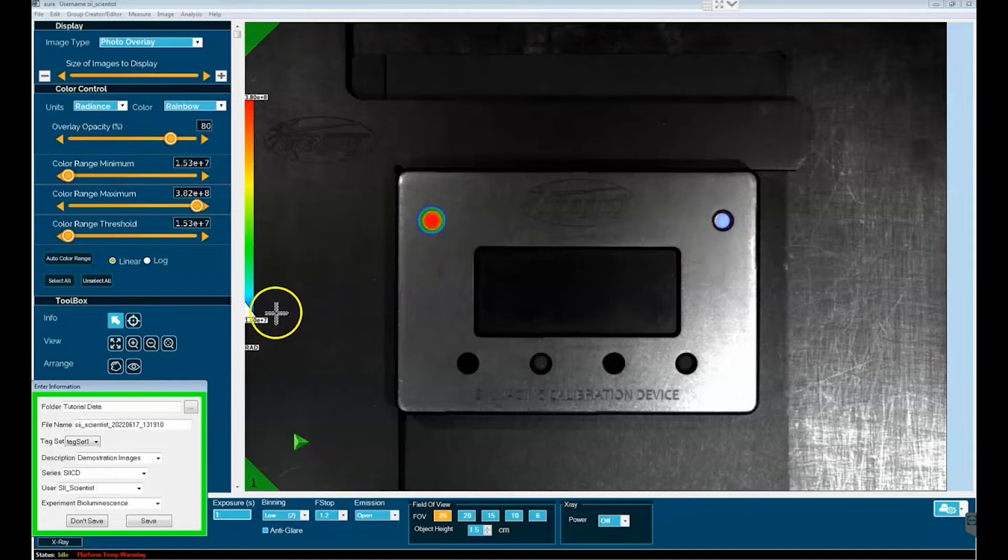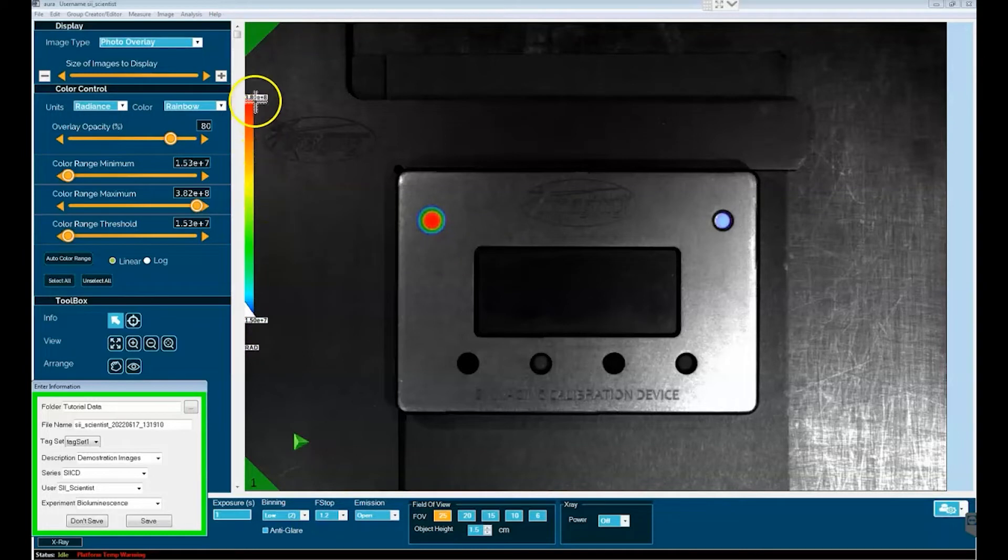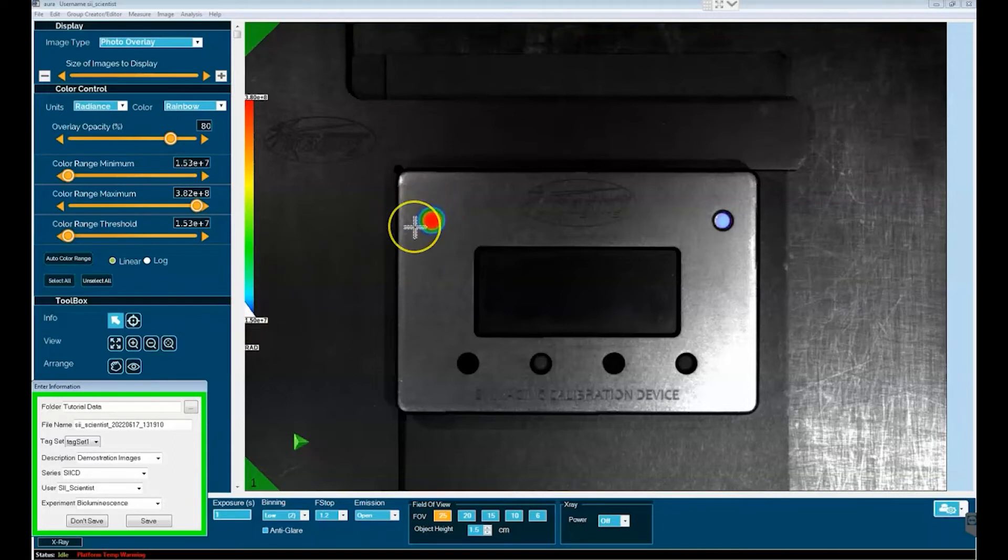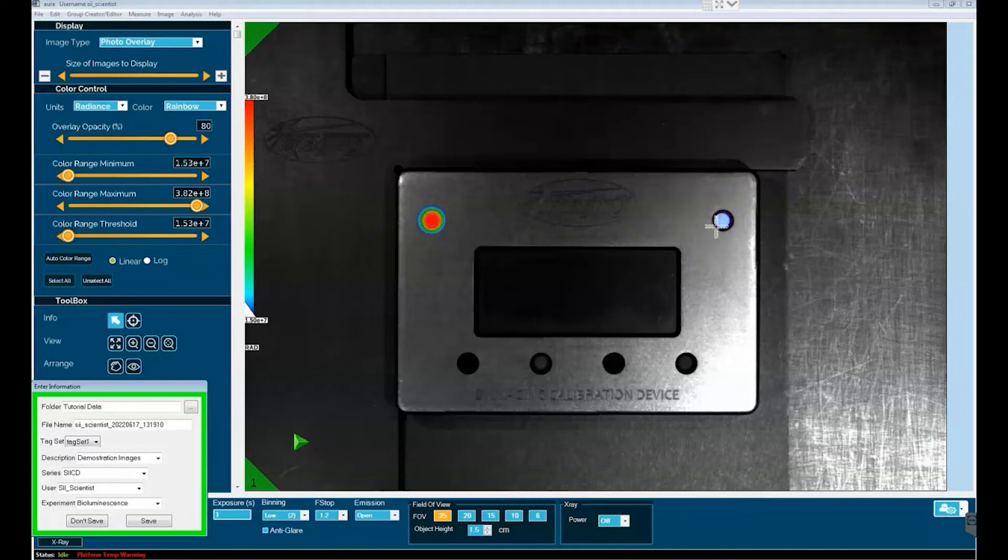If one looks at the calibration bar in radiance, you can see the low and the high value indicated. The lookup table is going to be red for higher values, blue for lower values. This signal off to the left is a stronger signal than the signal off to the right.